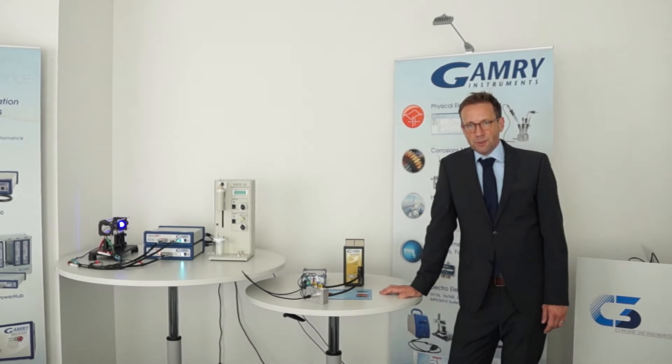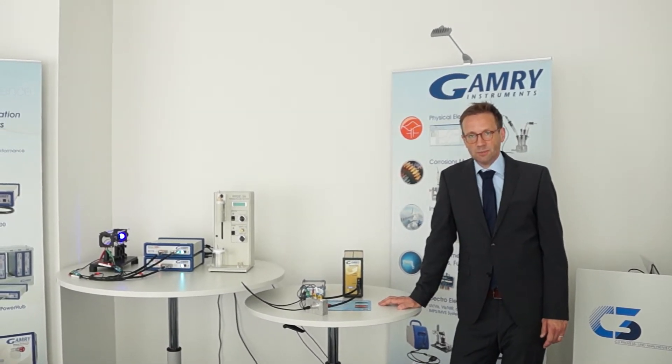Welcome, ladies and gentlemen. I hope we convinced you to try something new within electrochemistry. And here, I want to show you some of our examples.